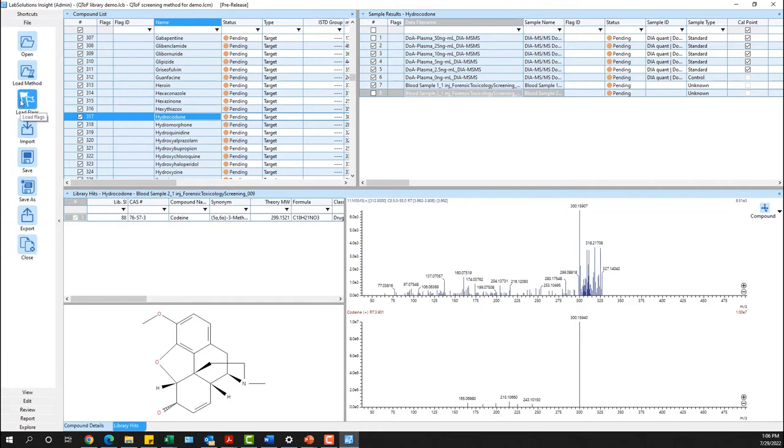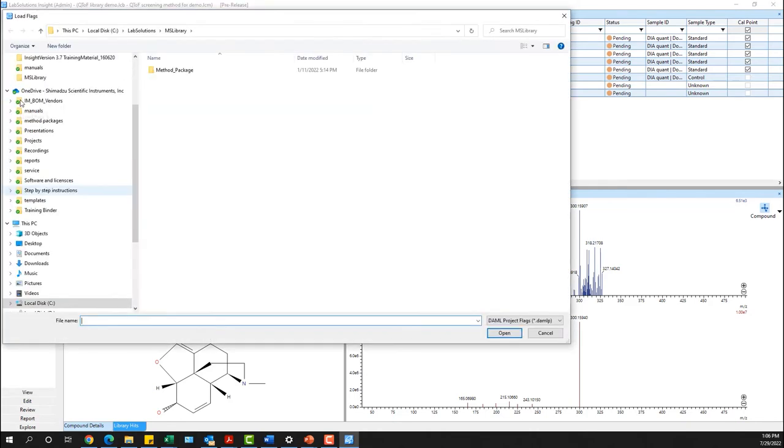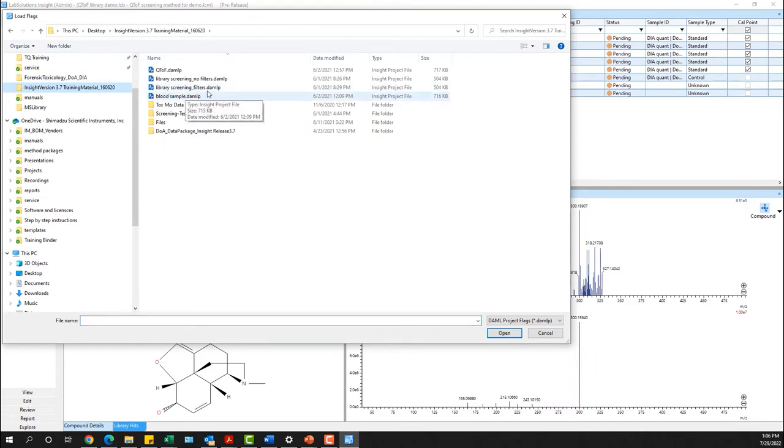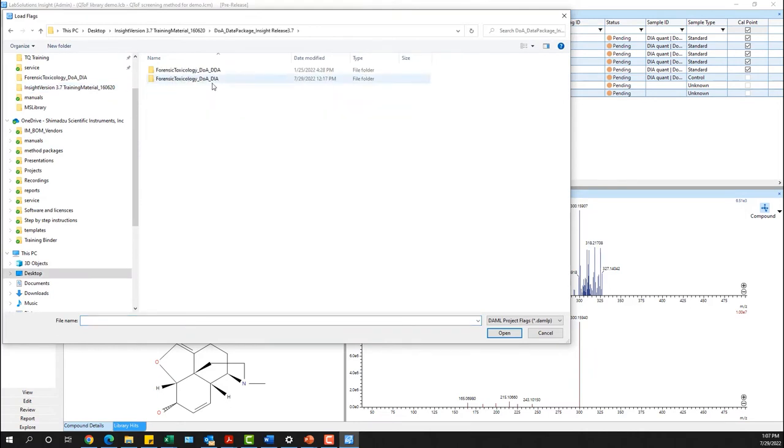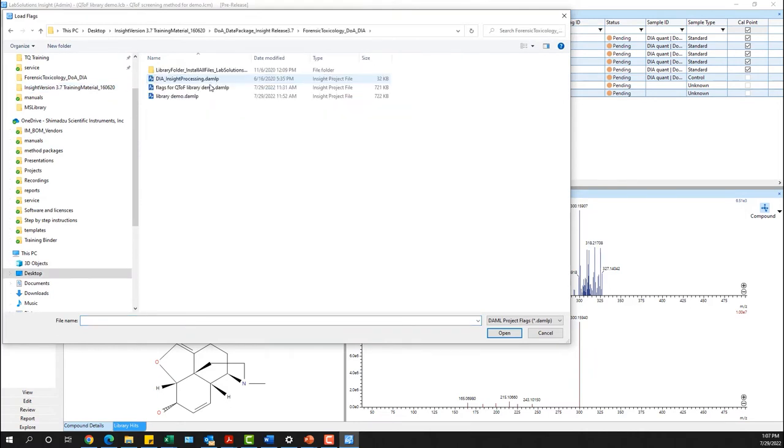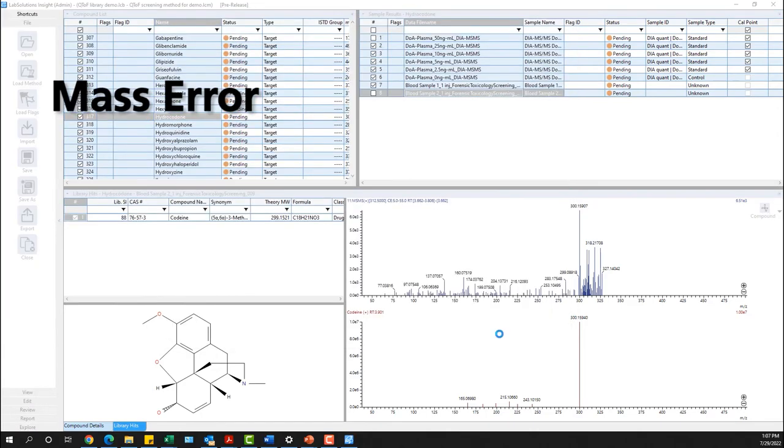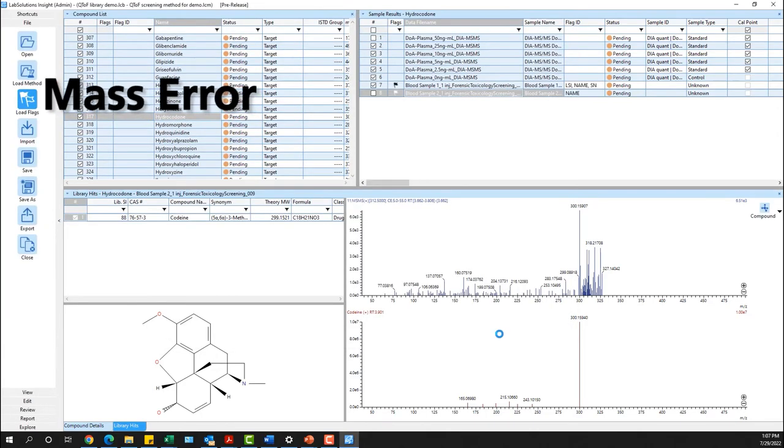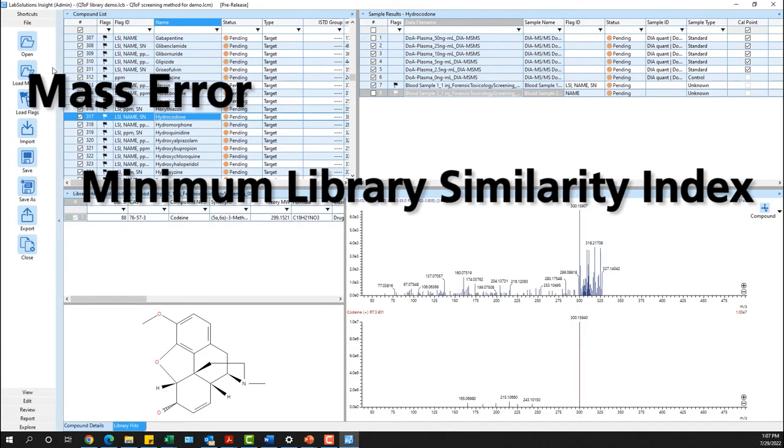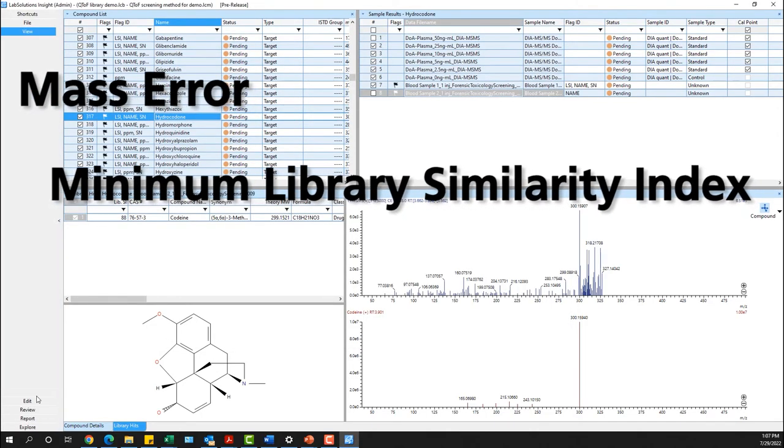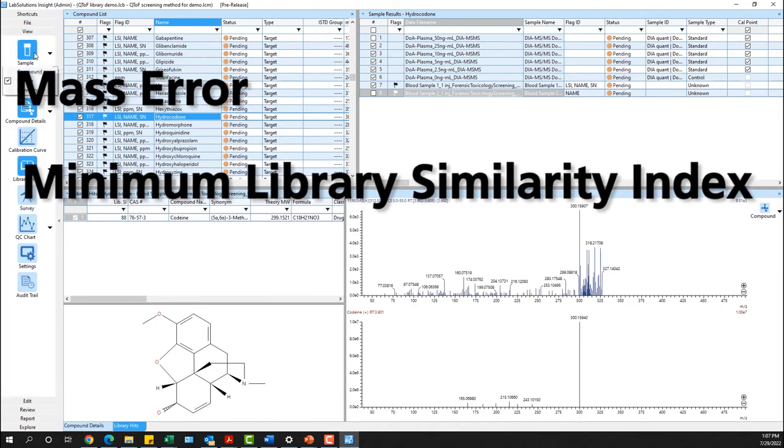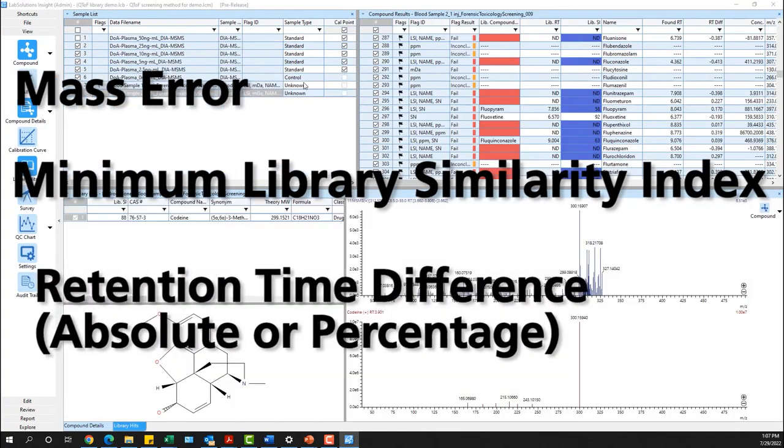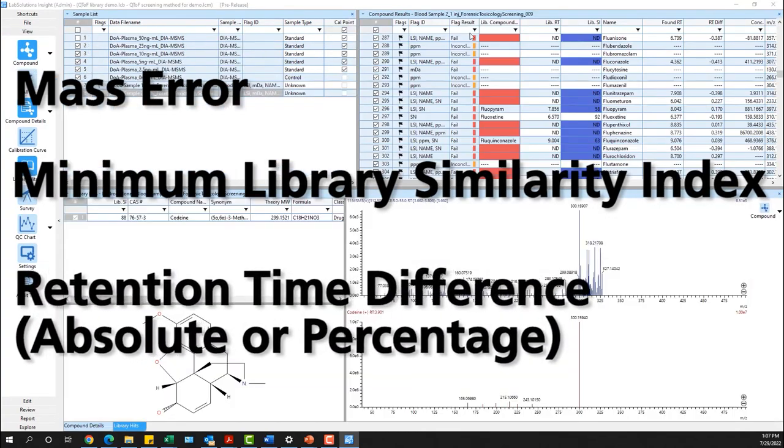Select the Load Flags icon to load a previously created flag file with defined criteria for each sample type that you will be analyzing. Some of the more common flags that are used are mass error for ppm or mdalton, minimum library similarity index, and retention time difference by either absolute or percentage types.